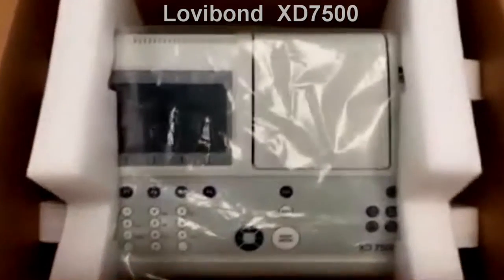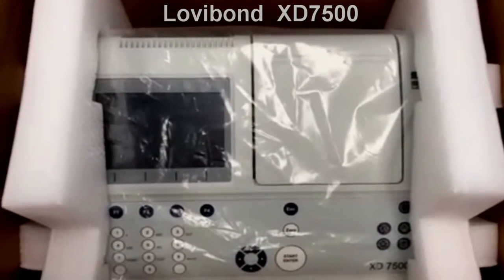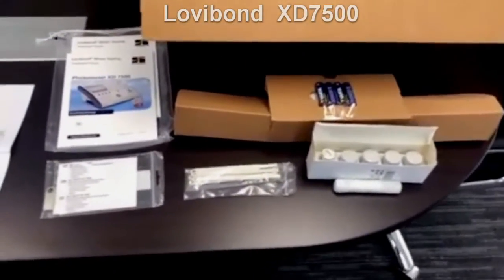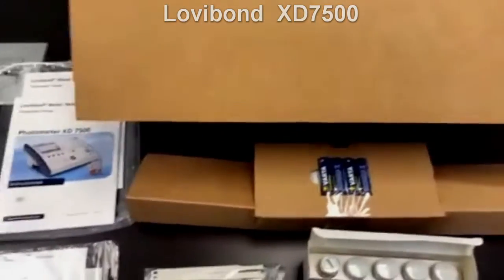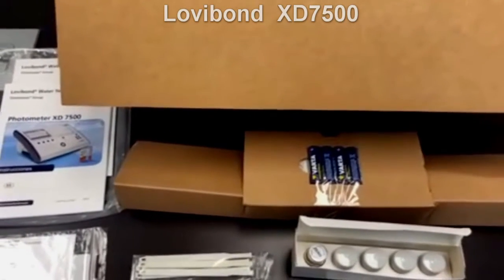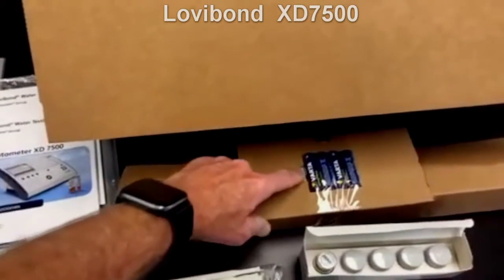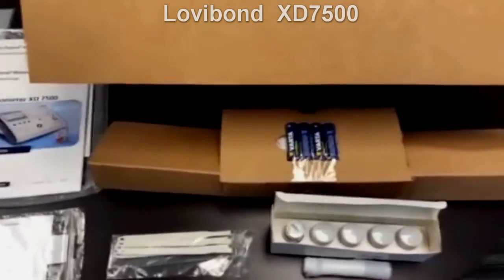Out of the box, first and foremost, you would have the instrument itself — the XD7500. I've already unpacked the components so you can see them. You'll get batteries for the instrument; these are backup batteries to make sure that if you lose mains power, you won't lose your data. Those are stored in the instrument. There's also an AC adapter behind here that allows you to plug the instrument in.